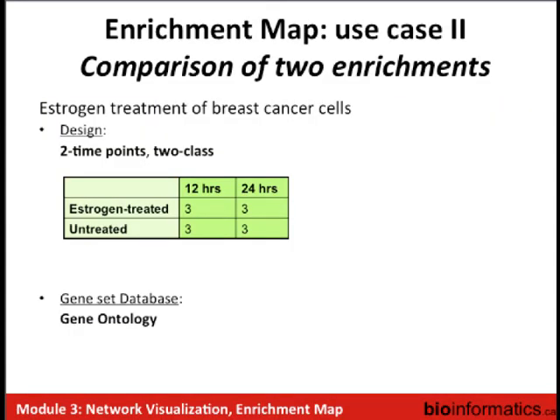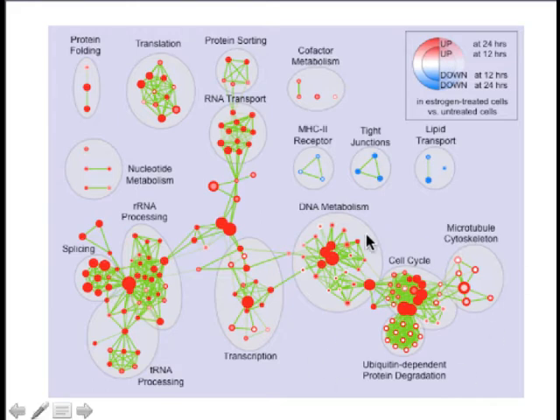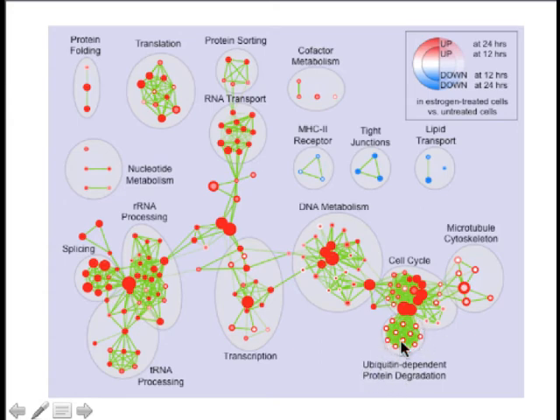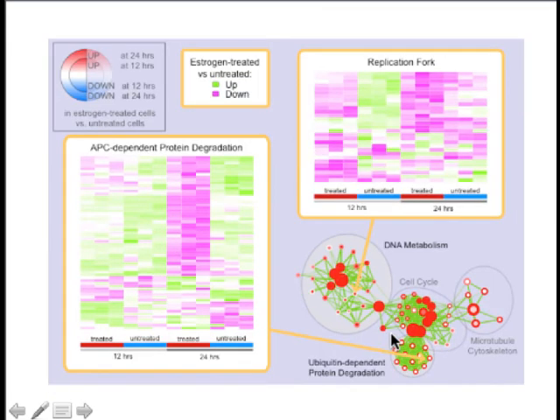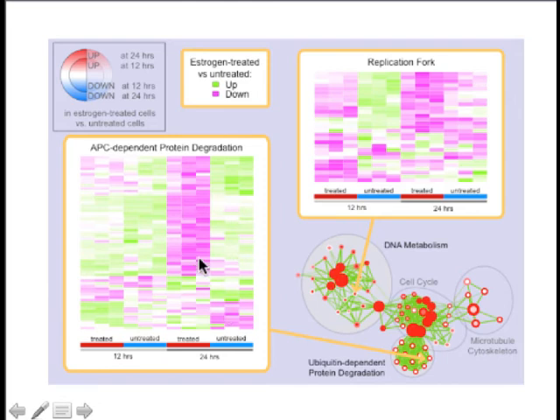Here's an example with two time points. Just like in Cytoscape, the enrichment score at the early time point is mapped to the center of the node and the enrichment score at the late time point to the border. Most nodes are all red or all blue — meaning pathways are enriched in both time points. But a couple of pathways like ubiquitin-dependent protein degradation are only enriched at the late time point. You can look at the heat map if you load your expression data into Enrichment Map — this particular pathway shows similar expression in treated and untreated at the early point, but very different expression at the late time point.